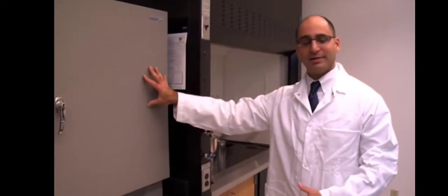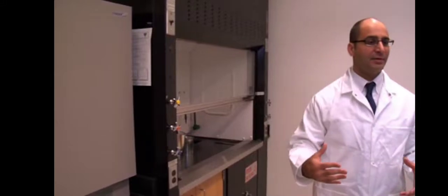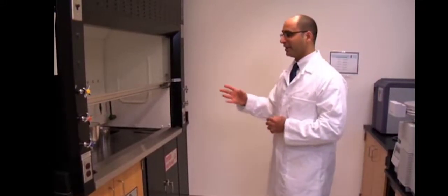This is our fire debris laboratory. In this laboratory we have various different stations where we analyze or prepare our samples. We have a sample preparation station on the other side. Once our samples are prepared, we then bring them over to our oven where we place them to heat for a designated period of time. After that heating period, we then need to separate out whatever we're going to extract from that sample using various different techniques, but one method we use is a solvent extraction. That would be performed in our hood.